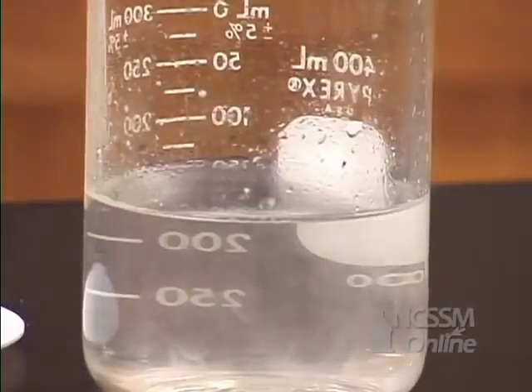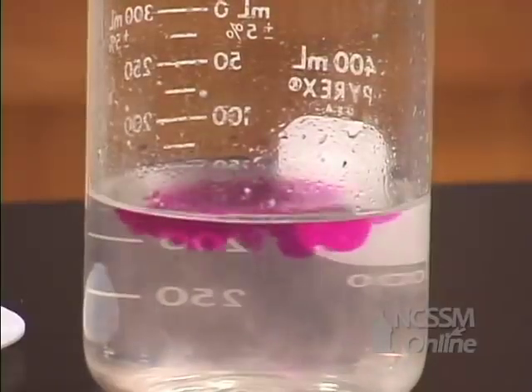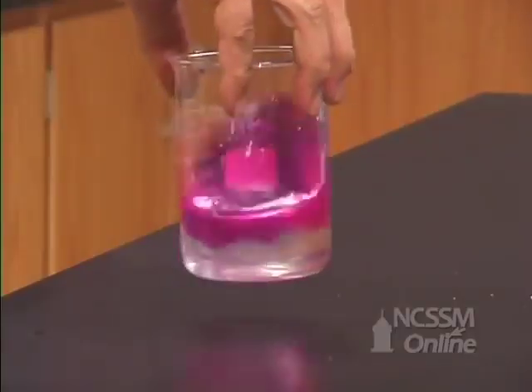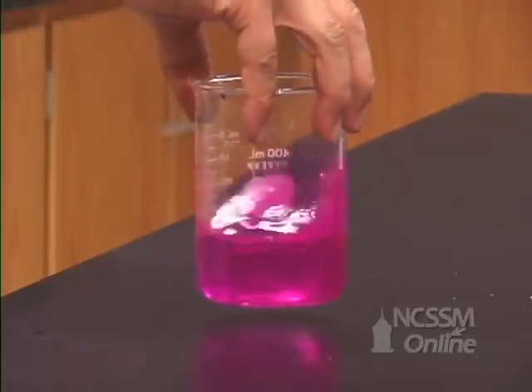We can test for the formation of potassium hydroxide by adding phenolphthalein. The solution turns red-purple due to the formation of potassium hydroxide.